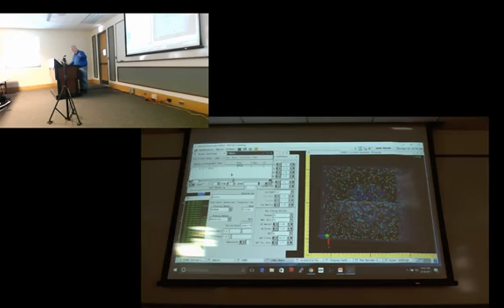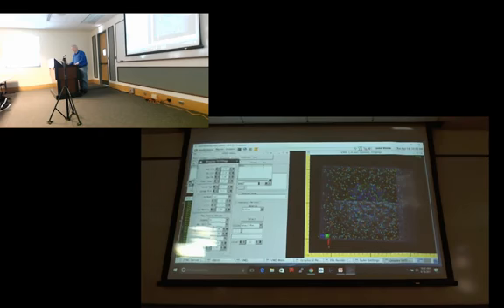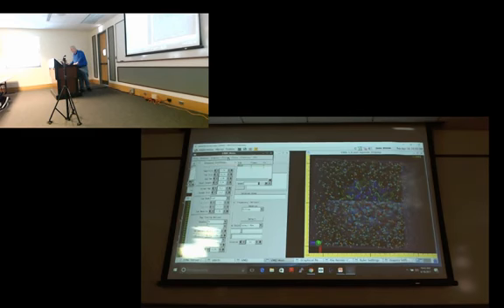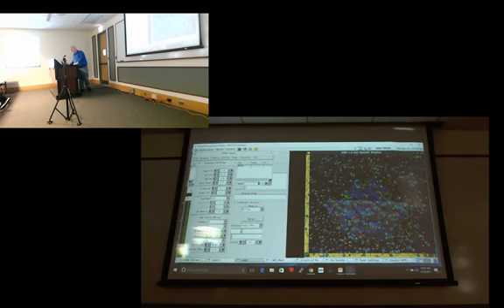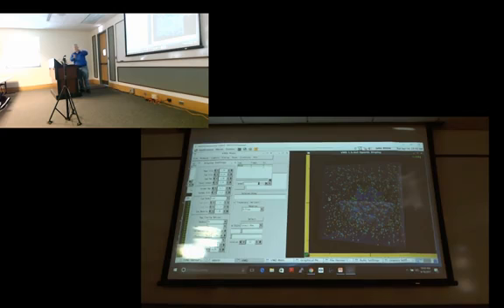But I was going to say also, in VMD, in this display settings menu, you can change the parameters for the perspective projection by changing screen distance and screen height. This is a pretty wide field of view because the screen height is tall relative to the distance back, so it basically has a very large vertical field of view. If you want to make it less of a strong perspective, you can change the screen height and make it smaller. By making the screen height smaller, it sort of has the effect of zooming in on the scene a little bit.